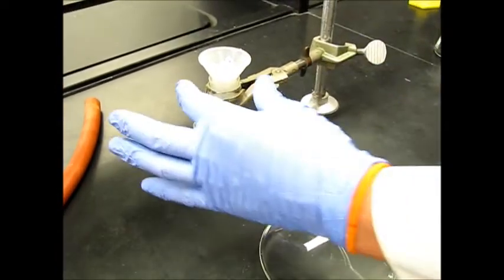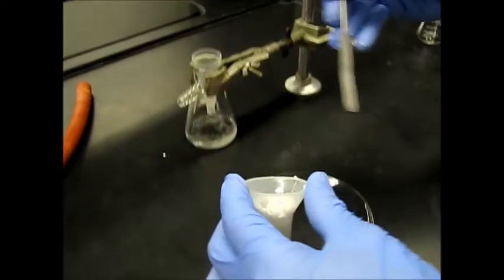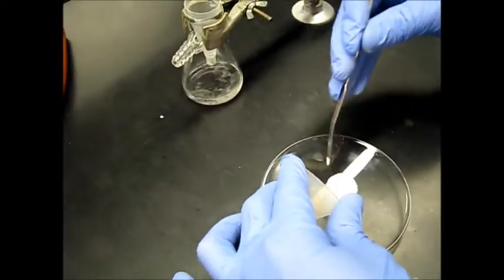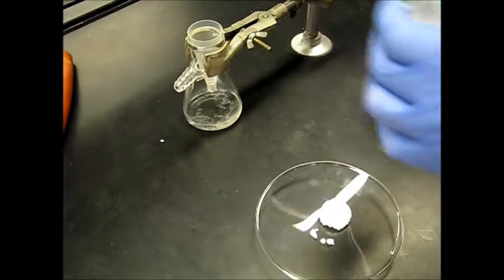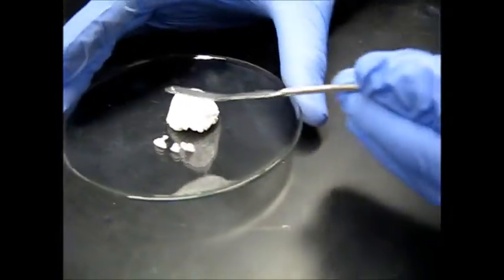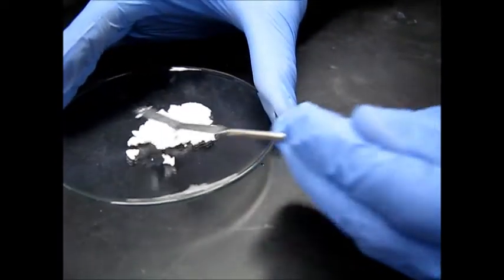So now we're going to go ahead and transfer our product onto this watch glass, which we've already weighed out. Just kind of scoop, flip it out. So we're going to set this into the oven. It's not going to dry super efficiently like this, so we're going to press it out a little bit, just to help it dry once it's in the oven.